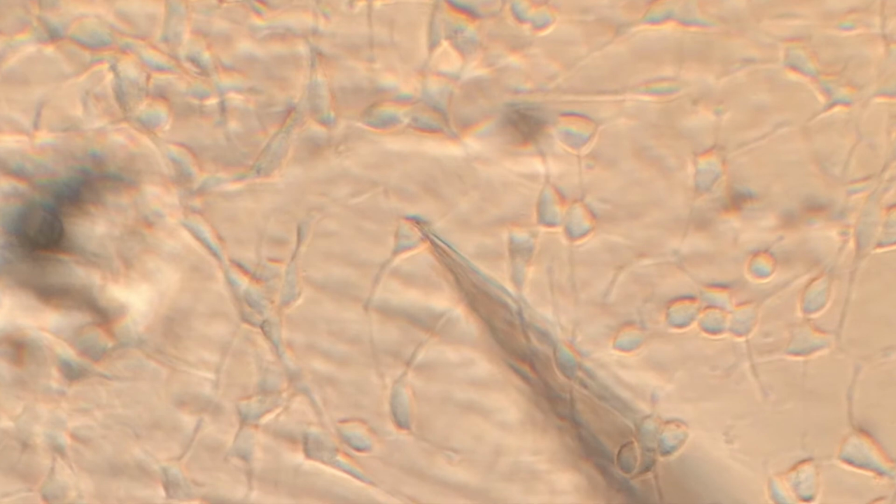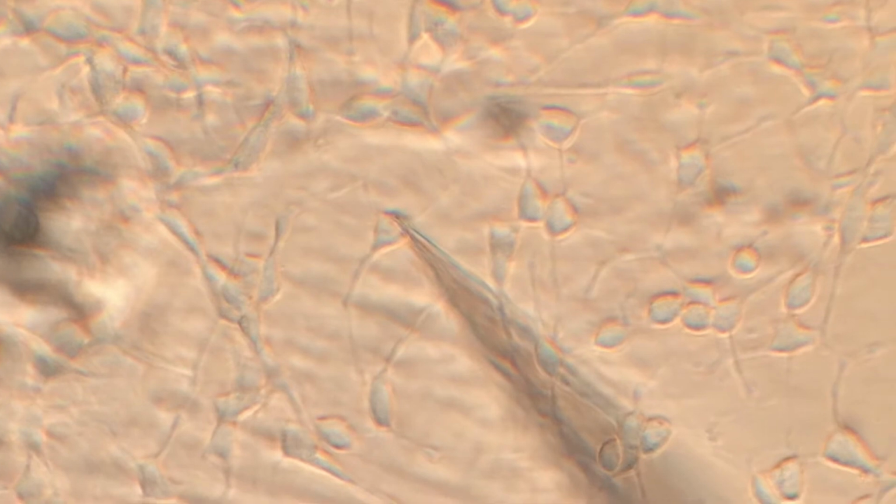In this experiment, they use fetal calf serum as a non-specific agonist that activates this translocation. Here they are studying sodium channels, but with the same methods, you can study calcium channels. Besides, in this lab, they work on both sodium and calcium channels involved in prostate cancer.